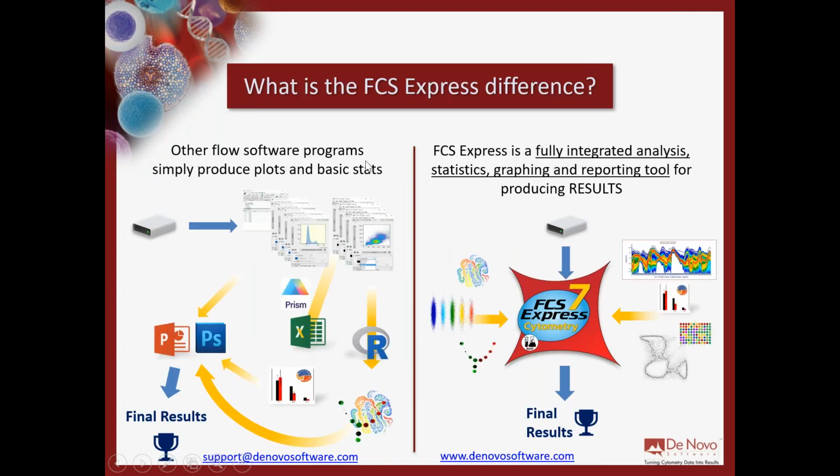And that's, again, the big difference between our software and other software packages that are on the market. When you're working with other software tools, you may be getting basic plots, you're getting tables of statistics, but more often than not, you're copying and pasting and moving those things out to Prism and to Excel. I've seen people do really complicated things in Photoshop just to put a little white text box over an axis label, and also having to use additional tools like R. If you don't have some sort of programming background, it can be difficult. All of that before you get to a result.